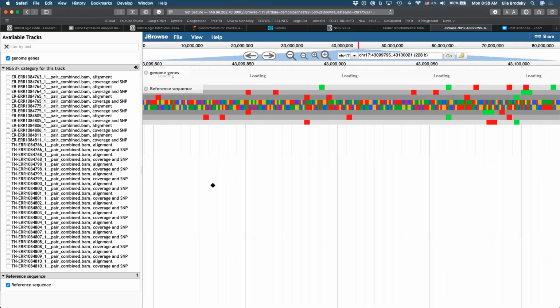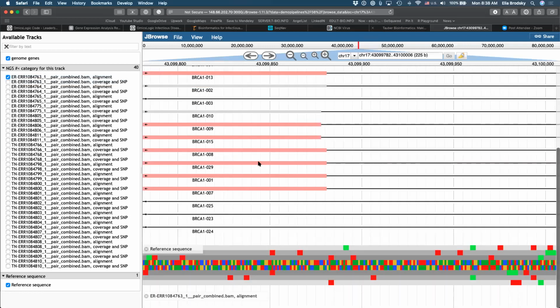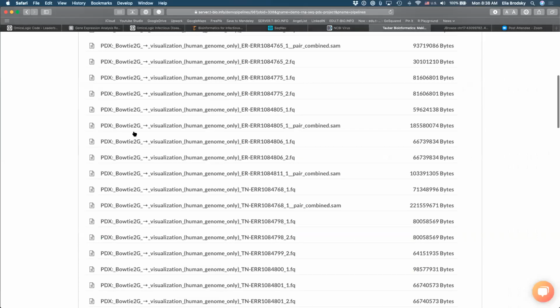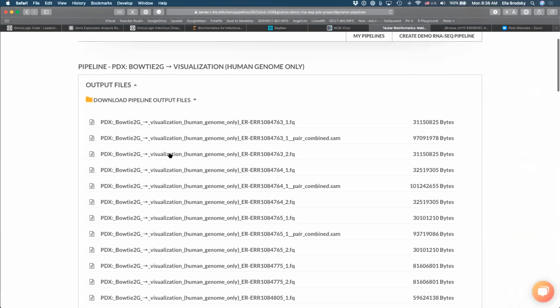Okay, so here you can see again this data is being mapped and I can see the reads. But importantly, when I go into the results, I will be able to find not only what is in my data, but also the individual reads and the percentage of how many of those reads were mapped onto the reference genome. Using such a technique, I will be able to identify potential pathogens from a viral or a microbial database that I could then study in a more detailed way.